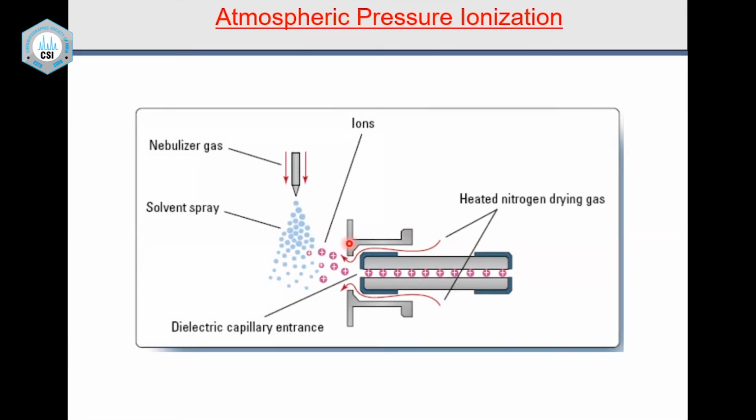Ionization is happening at atmospheric pressure, right when the sample comes down from the needle, when it gets sprayed, and then you have to do a little bit of solvent chemistry. I will talk to you about the solvent chemistry later. And then your solutes, which are surrounded by the solvents, undergo an electrostatic current between the needle and this main frame, and that will be around plus minus 5 kV, not electron volt, kV. When you have that electrostatic force, the ions are formed inside the spray.